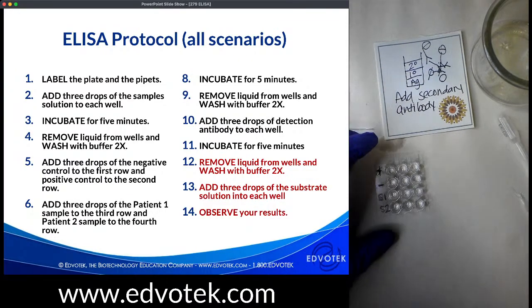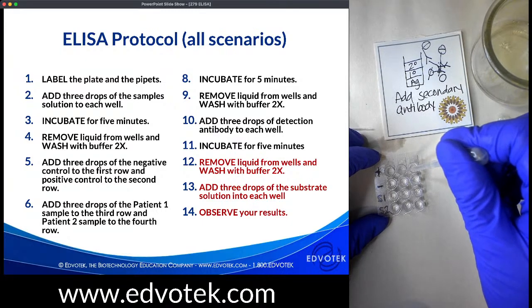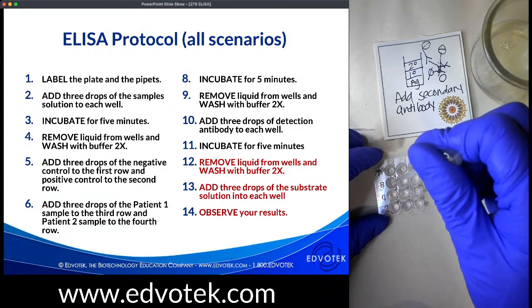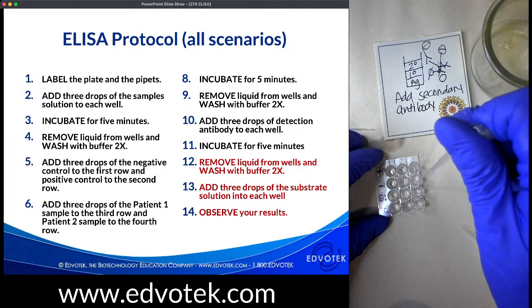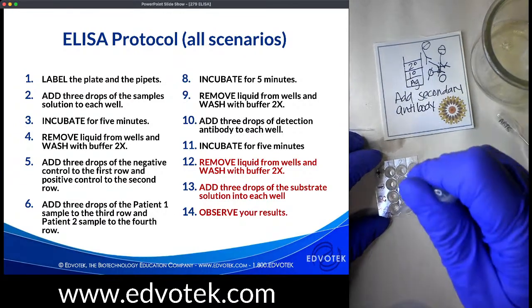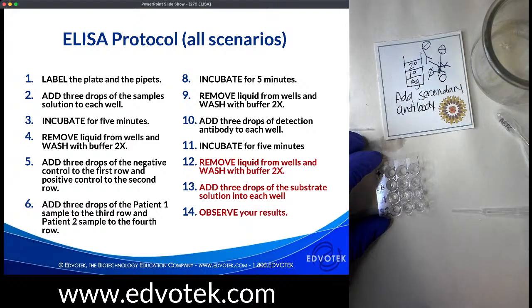which would be an area where we could potentially have cross-contamination. Again, cross-contamination is sometimes a part of science, as much as we don't like to admit it, and that's why we need to use good lab practices to reduce the amount of cross-contamination. That's why we have control samples. If our control samples show signs of contamination, that shows we did something wrong and the results of our assay may not be able to be trusted. I have my S2 pipette, so I'm going to go to S2 instead of S1 this time, just because I already had it in my hands.